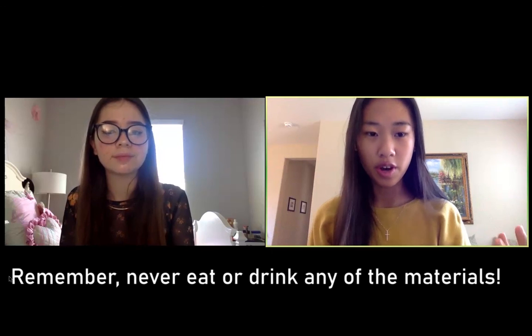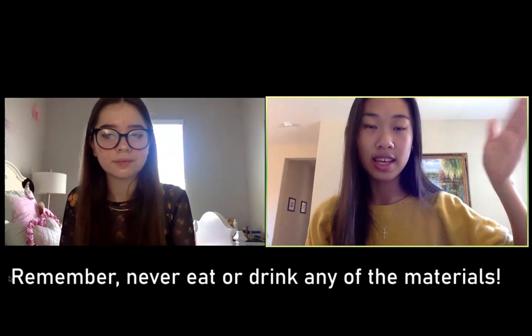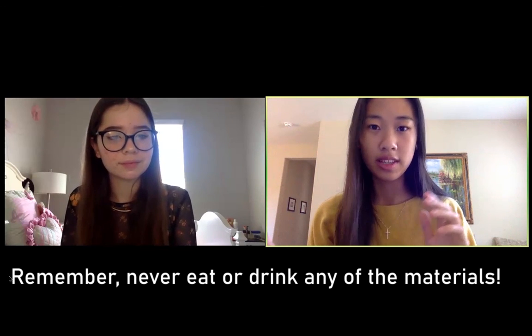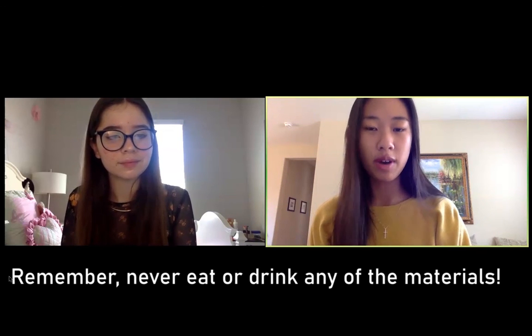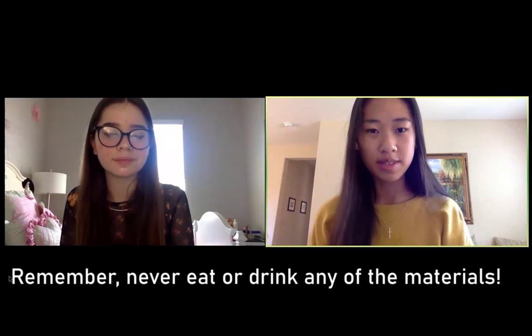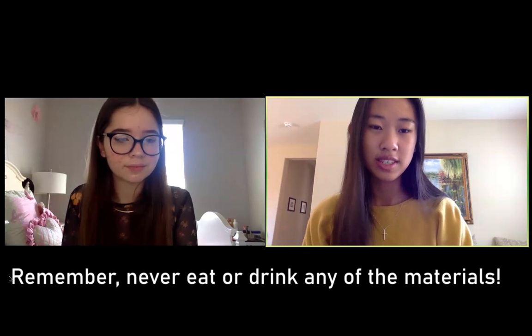And then once you know what the pH is, you can look at the list of potential liquids that we give you on the worksheet, and then you can either change your guess or hypothesis or keep it the same. So the experiment is we want you to guess what the mystery liquids are, using pH to identify.